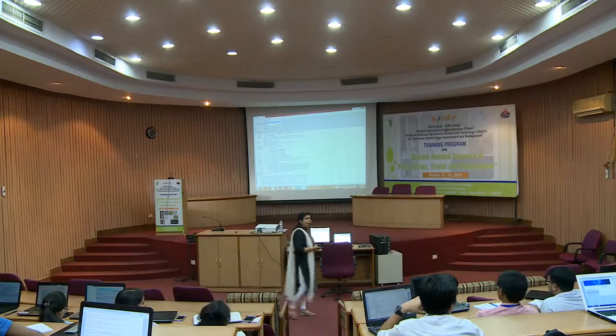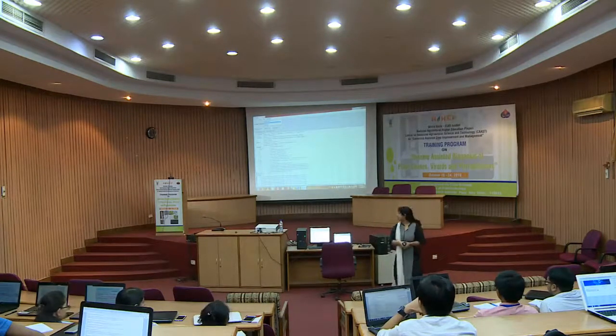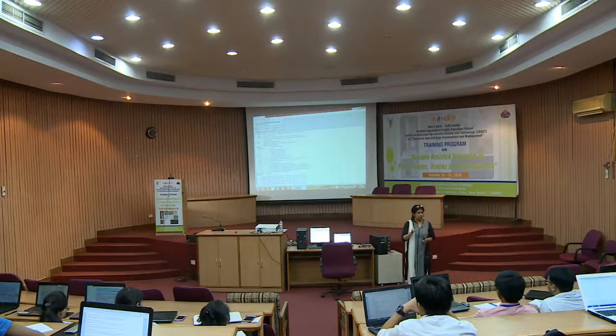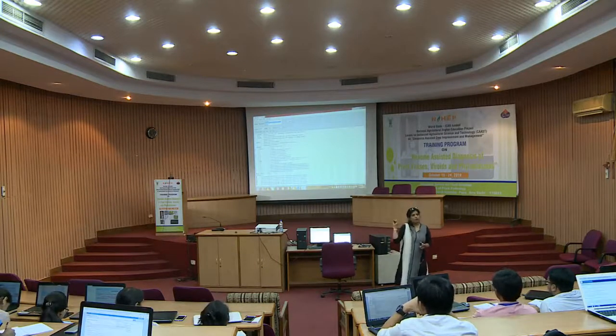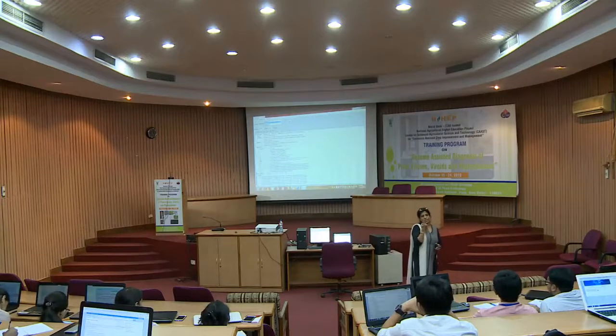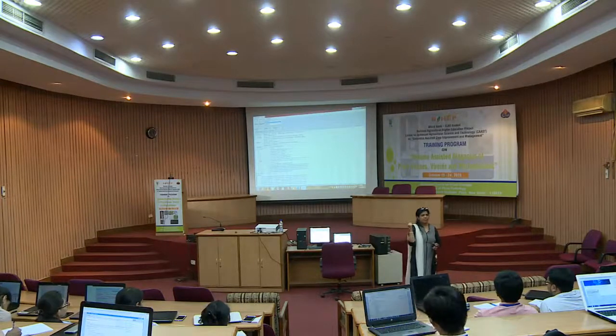We are having 6 frames now, right. Which is the right frame? The first thing is that it should have the maximum coding region, right? Stop codons will be fewer. What I told you, that you do the NCBI protein BLAST, there you will come to know the maximum identical match, and that translation you will be picking.